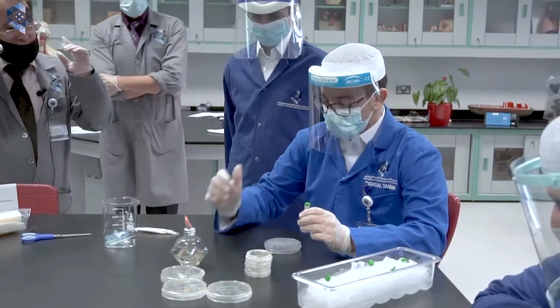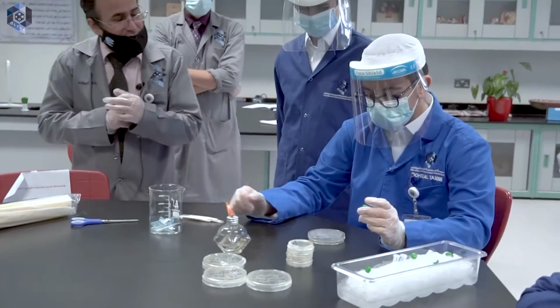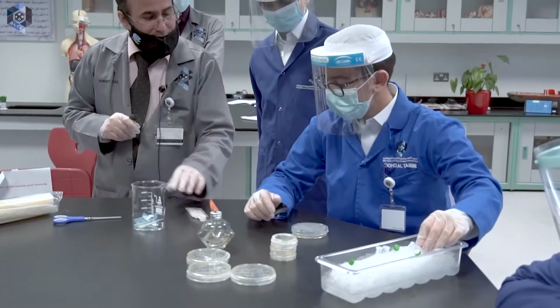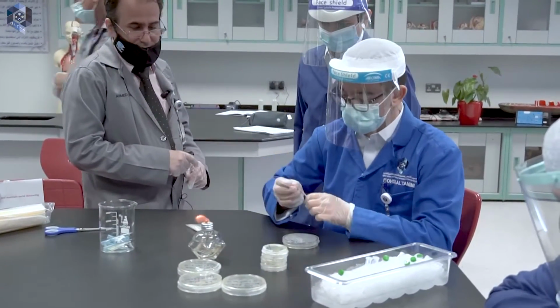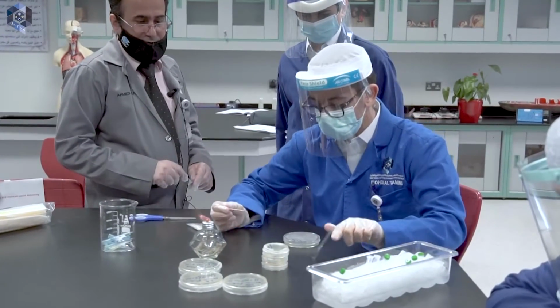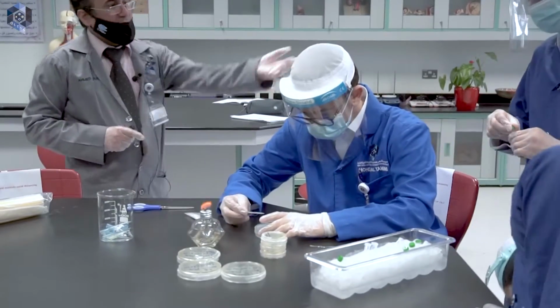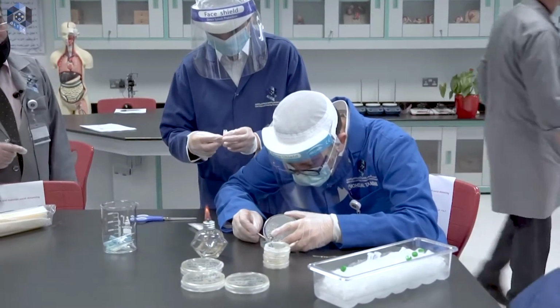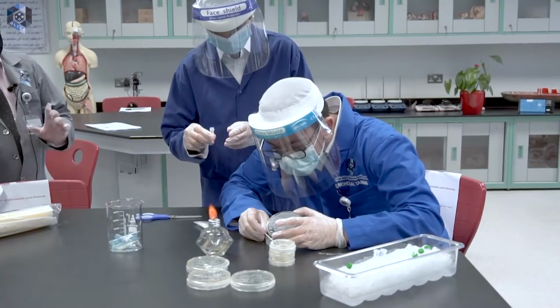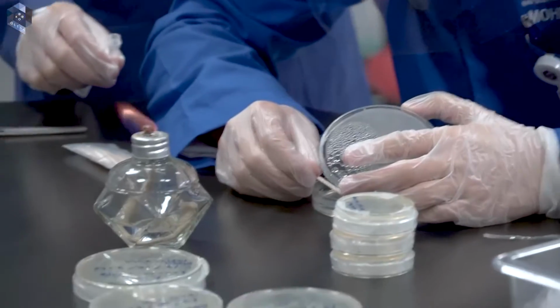First concentrate, focus. You will choose 5 well-grown bacterial colonies and place them in the test tube there, using the toothpick. Take the toothpick. Prepare the centrifuge tube. Come closer to him. Five to 7 colonies is okay. Try not to puncture the gel or remove the gel.